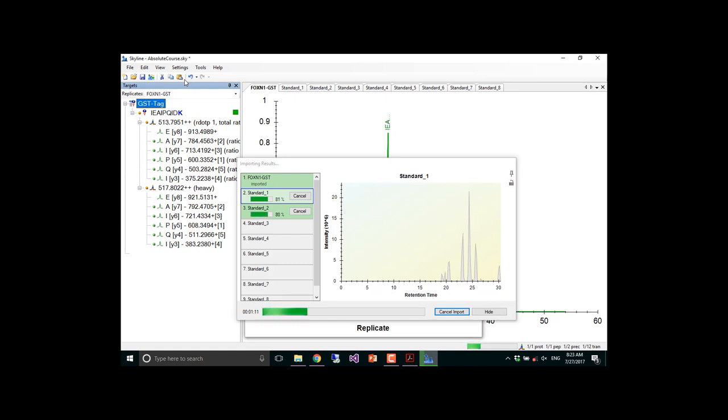No, in general, not. There are various cases where if you're going to do experiments repetitively, like if I'm going to be loading these same raw files a lot, which I am for these courses, then yeah, Thermo raw files, for whatever reason, load really slow.